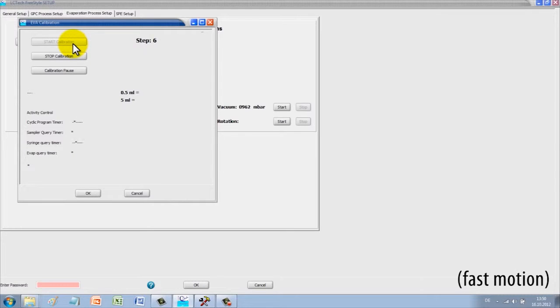Two evaporation principles are being exercised for evaporation. One is with vacuum and energy input similar to the rotary evaporator. The other is a gentle blowing off with nitrogen. Each technique can be used individually or in combination of the two together.